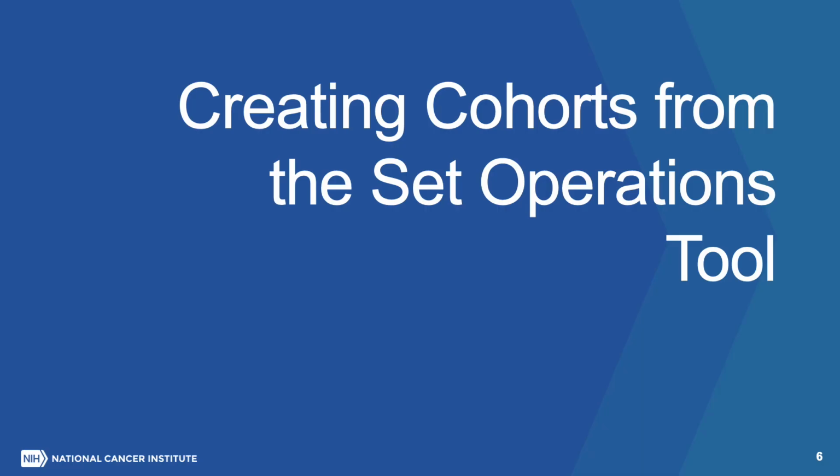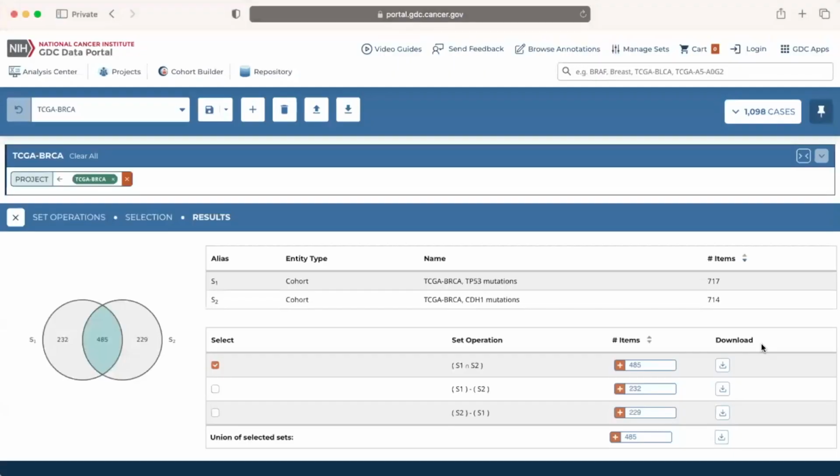Creating cohorts from the Set Operations tool. The Set Operations tool allows users to create new cohorts based on subsets. We can use the buttons in each row of the overlap table, or click the corresponding areas in the Venn diagram to select specific subsets for inclusion in our new cohort.